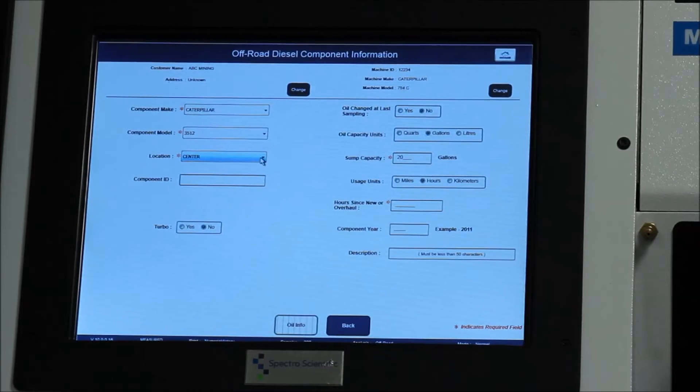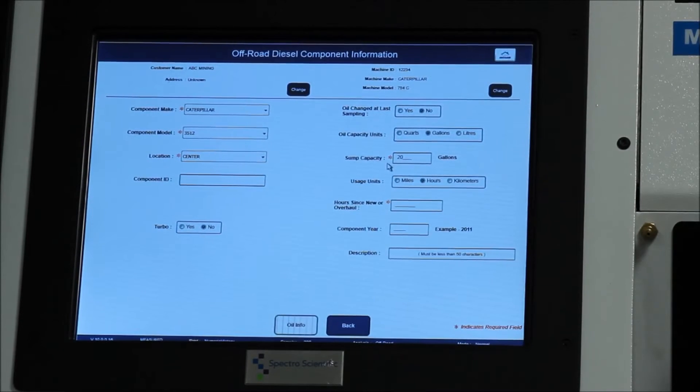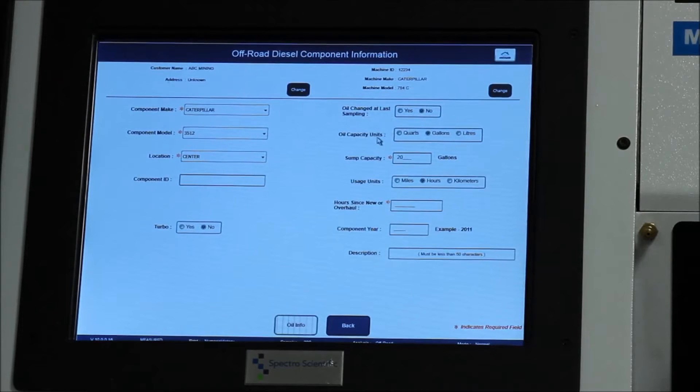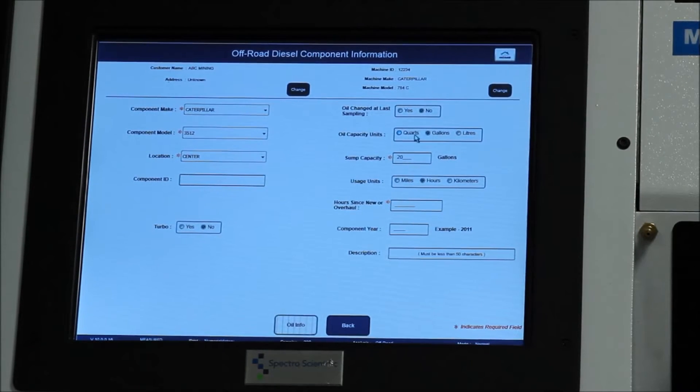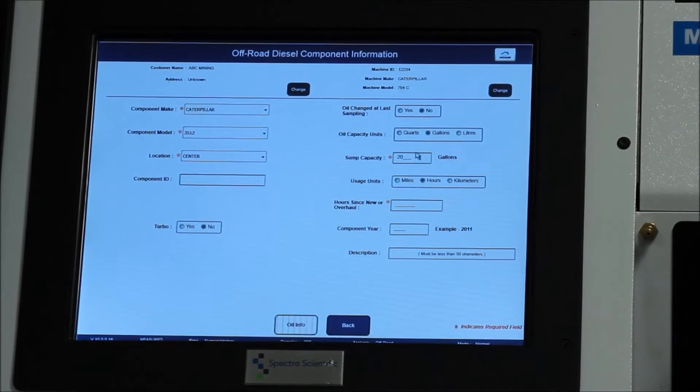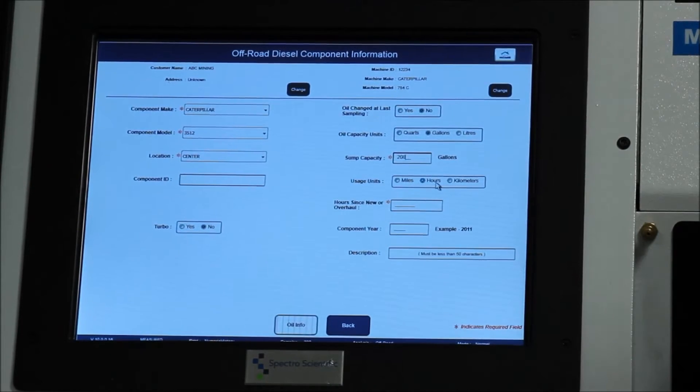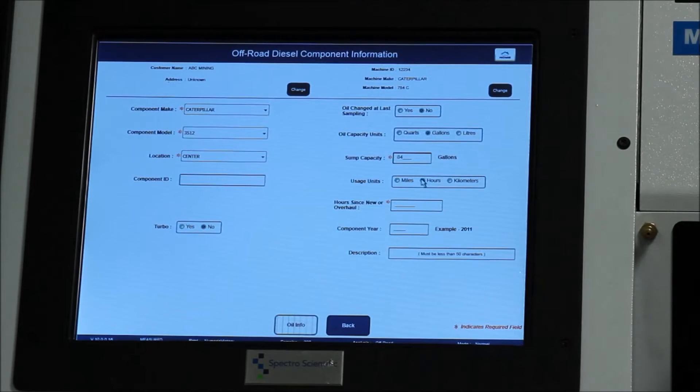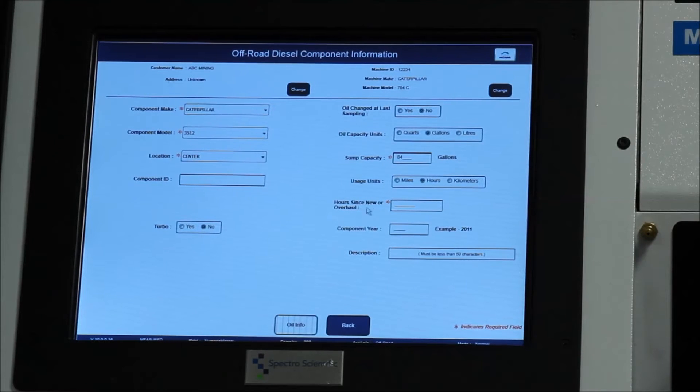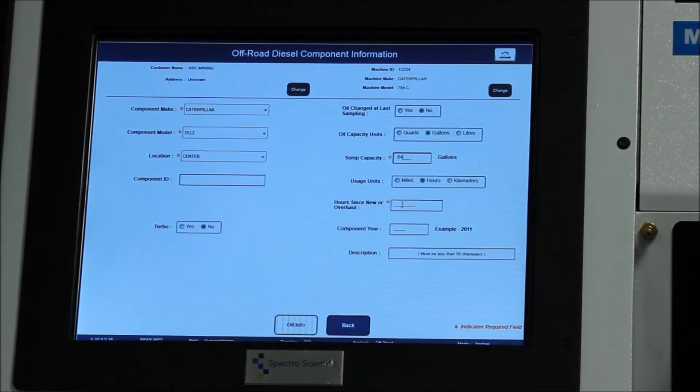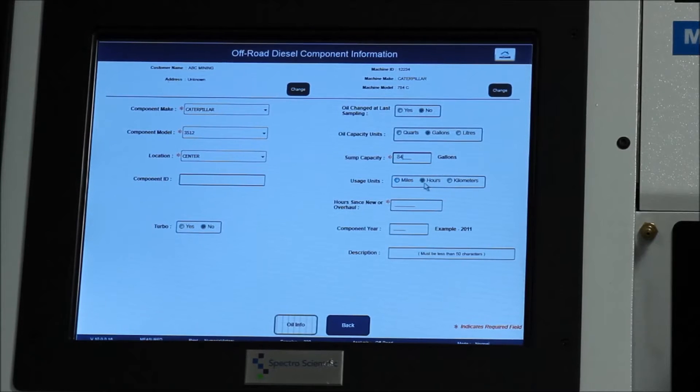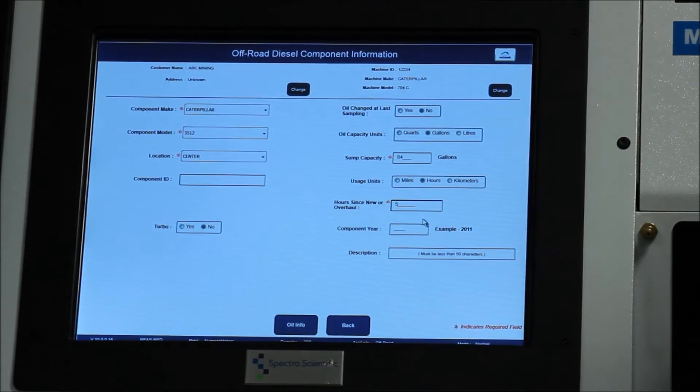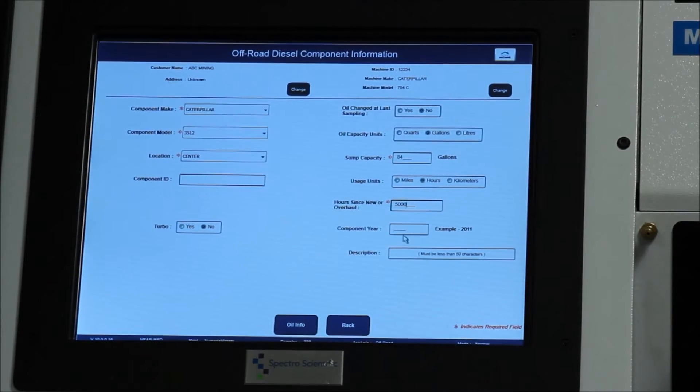Center location is what we're going to choose. Again, look for the red asterisks as to what you need to enter for information. Next I want to know the oil capacity. You can choose to set this in quarts, gallons, or liters. We'll choose gallons. And then the sump capacity on the equipment, we can change this into 84 gallons. And next it wants to know the hours since that equipment was new or last overhauled. This can be in miles, hours, or kilometers. We'll set it in hours and we'll say it has 5,000 hours on this engine.